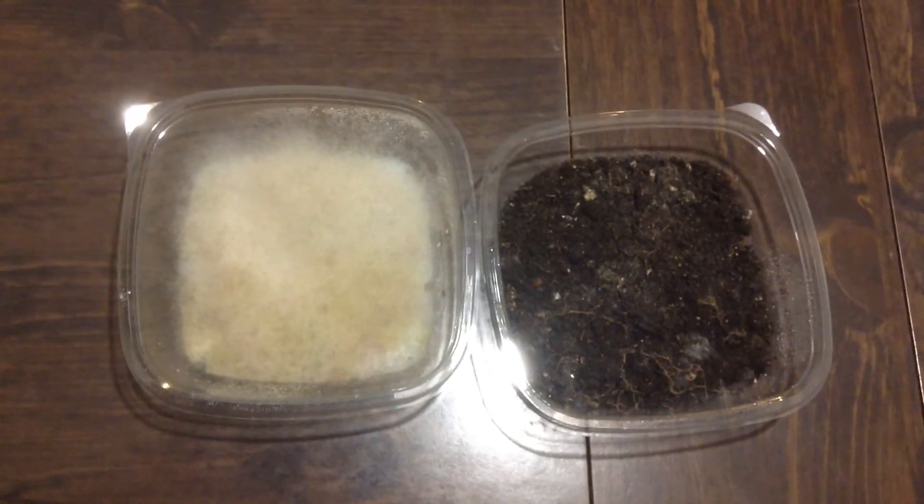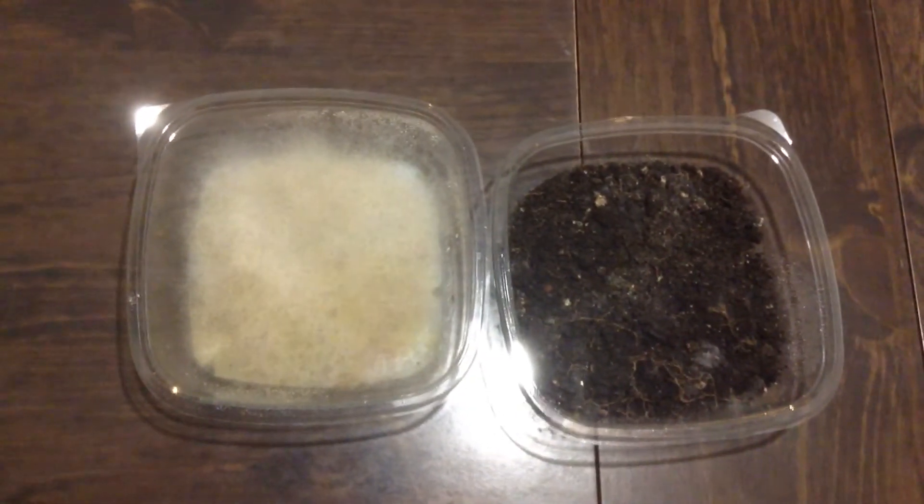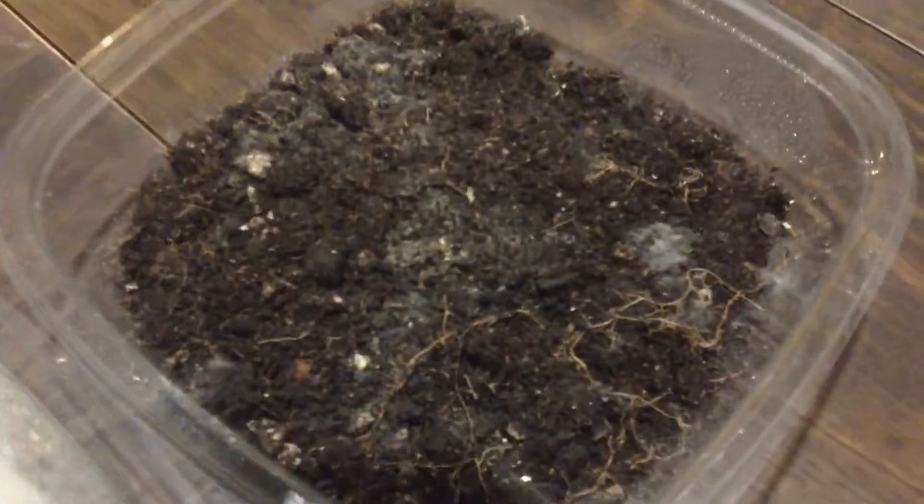Just to see what would happen — and boom, we have action going on here. On the right here, as you can see, there is a little bit of action going on; there are a few colonies that have been formed. But not as much as over here — whoa, it looks like a fur jacket on the left.